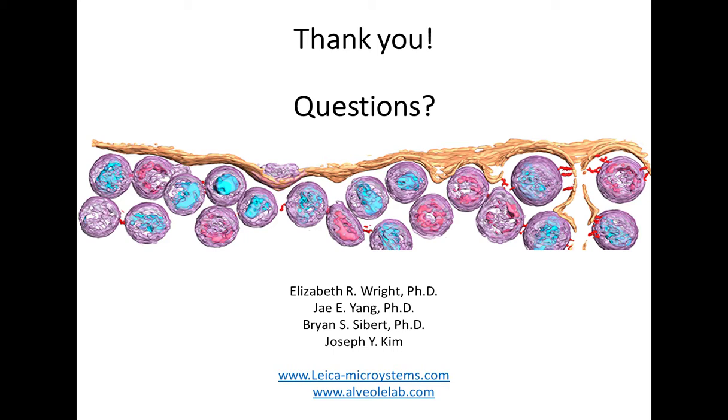Thank you. And this next question is for you, Jay. Does the Cryo-CLEM use the main user interface of LASX, or is it using the CLEM workflow that is based on LASX and matrix screener?